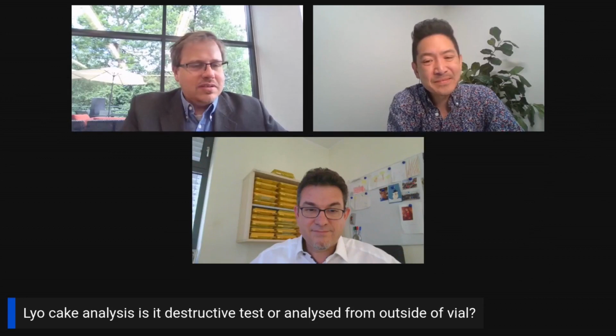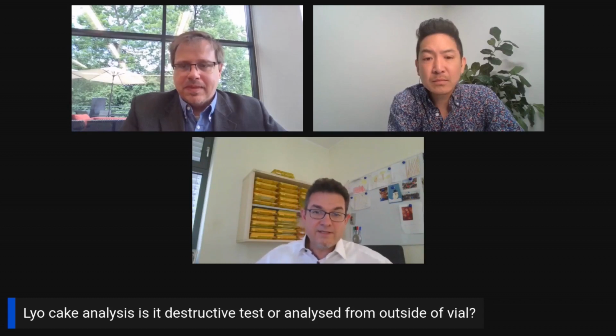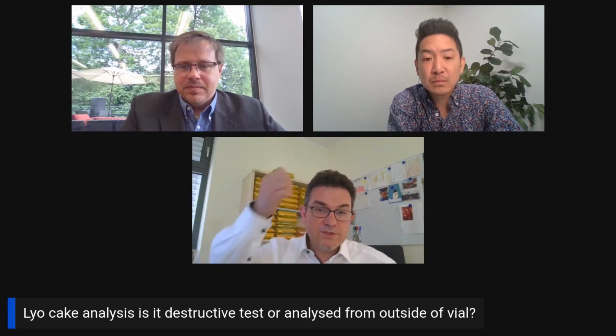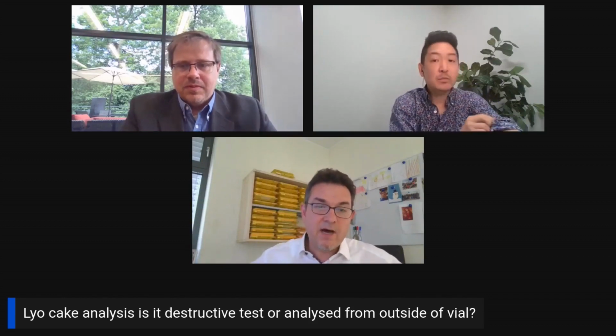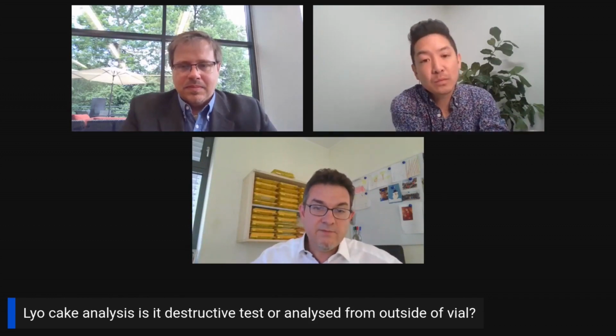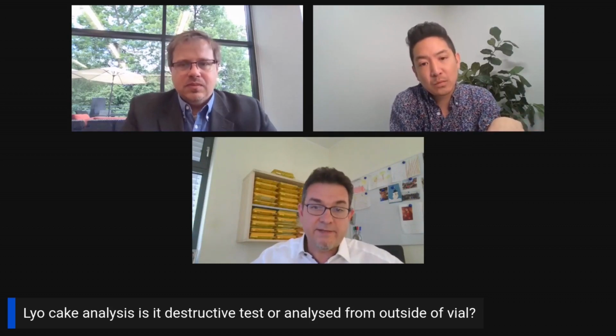Lyo cakes, is the analysis destructive or analyzed from outside of that vial? Yeah, 10 years ago or 8 years ago, it used to be destructive. So you would stamp out from the cake and put it into the microscope. But now with the new technique available, we scan it non-destructively within the glass. So that's fine.